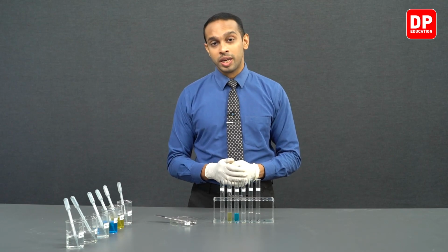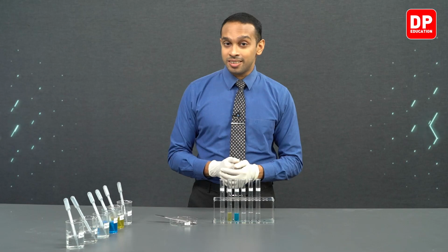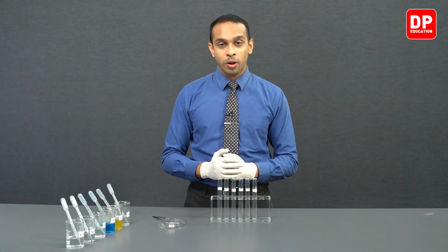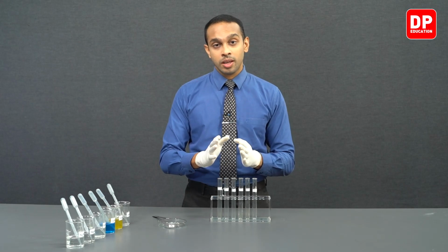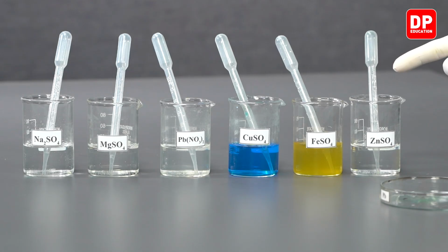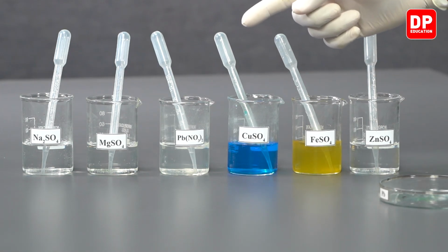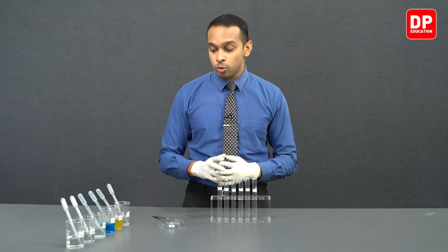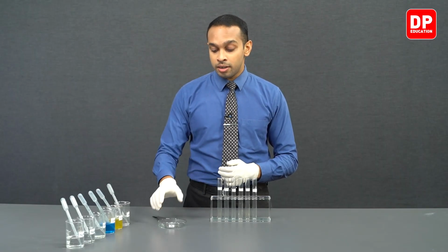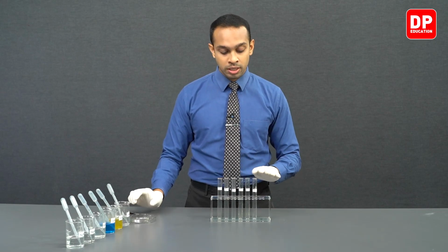After making note of that, we can move on to the next metal, lead. Now students, we move on to observe how lead metal reacts with zinc sulfate, ferrous sulfate, copper sulfate, lead nitrate, magnesium sulfate, and sodium sulfate. So we'll first take around 5 milliliters of these solutions into each of these test tubes.